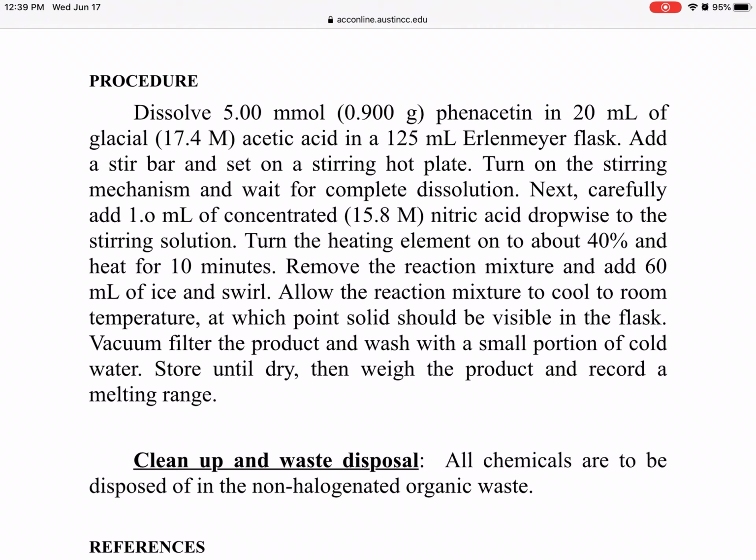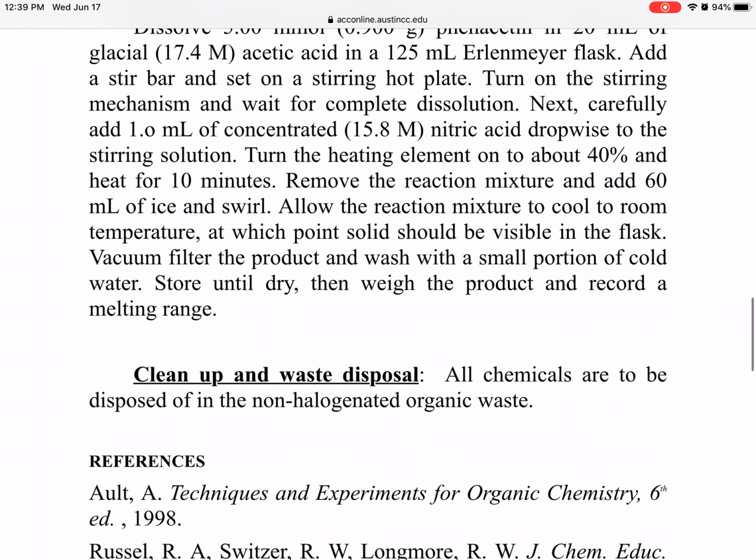This will dry even faster if you put it in the oven, keeping the oven temperature less than the melting point of the compound, otherwise everything will melt. Or we can leave it for a week or so in the hood to dry through the air. We can do that when we are performing experiments, but in a real lab we put it in an oven, because we need the product quickly. So that's how the experiment is done.